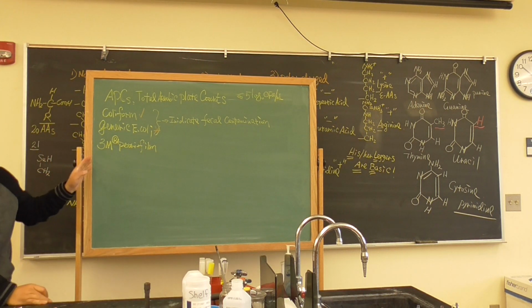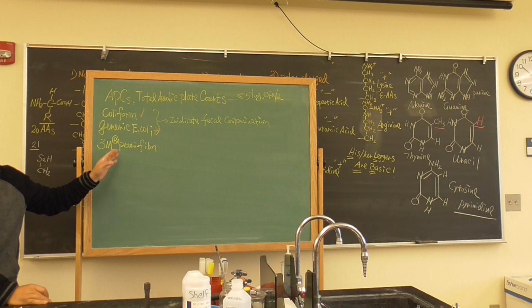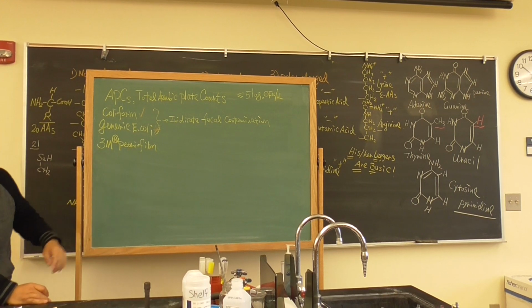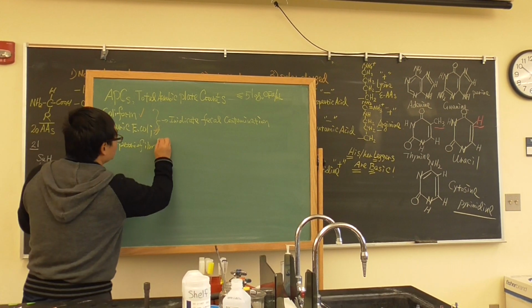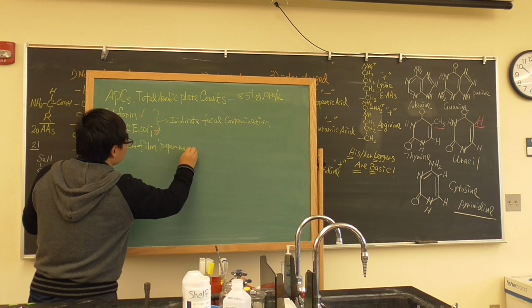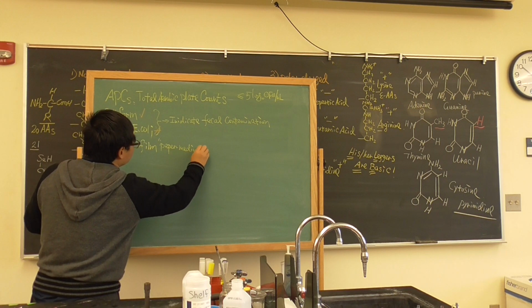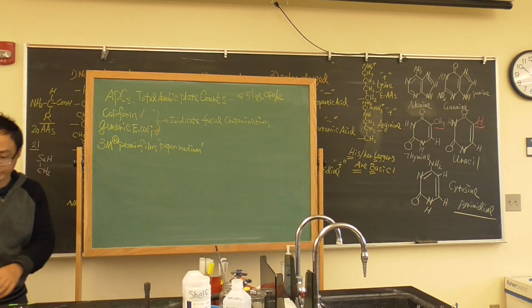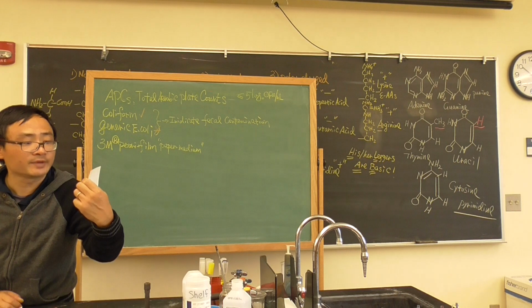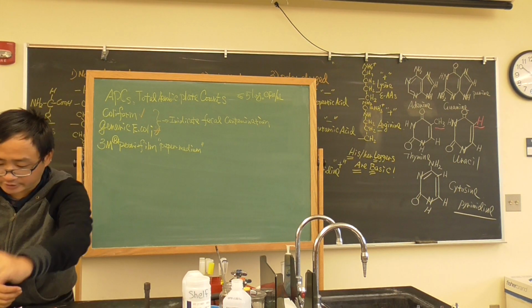You know, during the pandemic, lots of sanitizing hygiene gloves and masks came from 3M. So that's 3M Petrifilm. It's a paper medium, which means all the nutrition ingredients are in this dehydrated paper. When you see 3M AC here, that means aerobic plate counts.